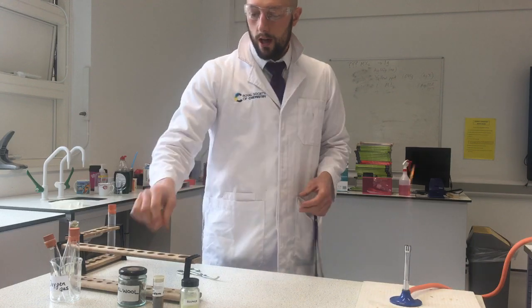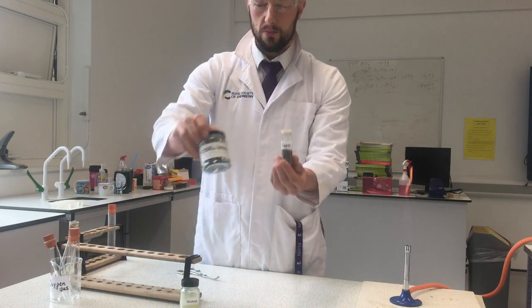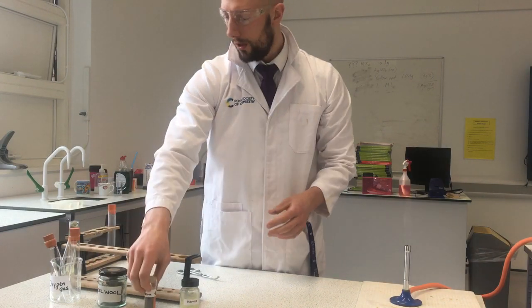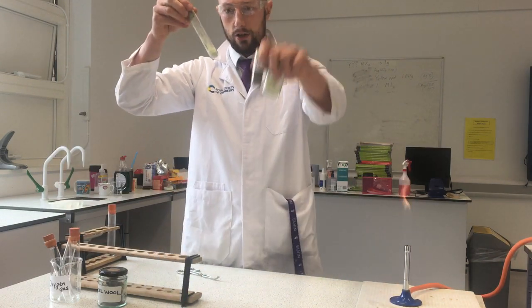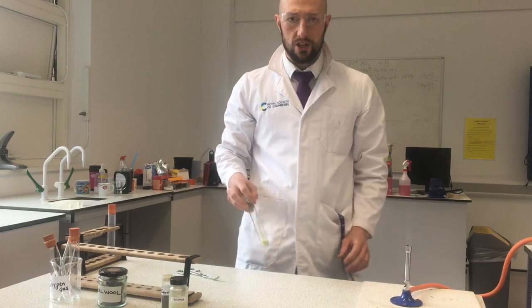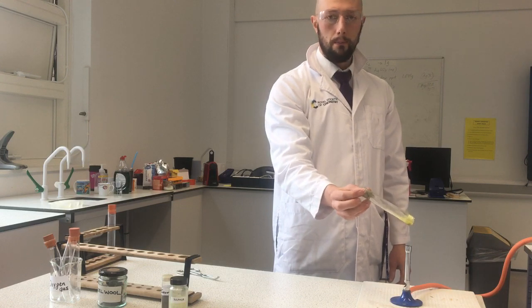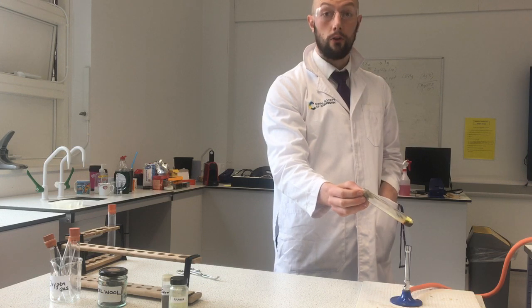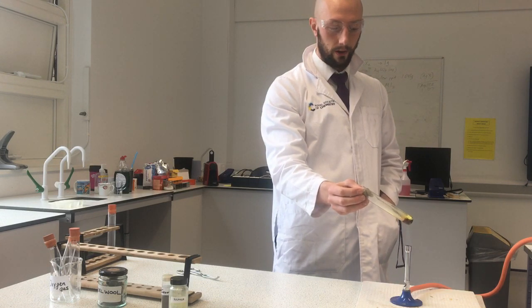First thing I'm going to do is react both of these with iron. So I've got some iron filings and I've got some steel wool. Both of these are just pure iron. To start with, I've got some sulfur and iron mixed together, so that's these two here. And I'm going to heat it in the Bunsen burner and we're going to see what the reaction looks like. I'm going to have to heat it up for a little bit. I've got some mineral wool in the end of the test tube to prevent too much sulfur dioxide from coming out into the room, because that wouldn't smell very nice.